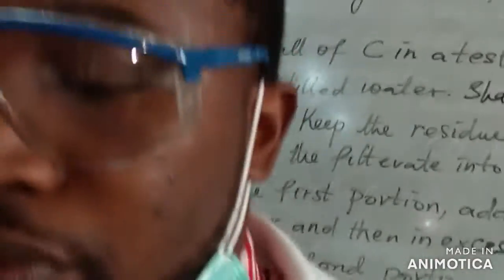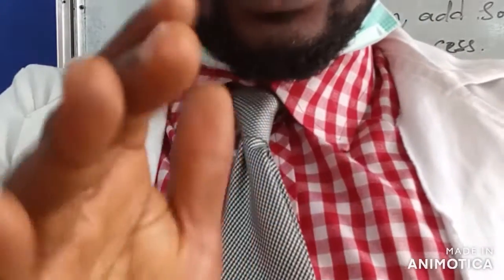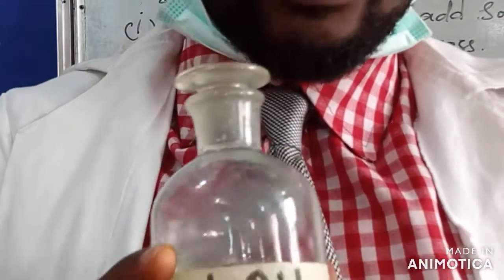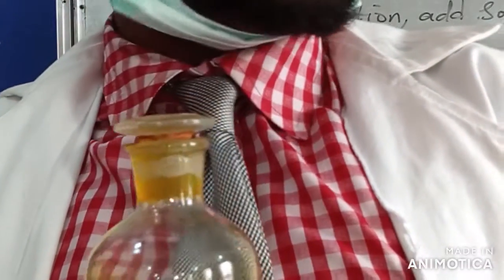Before I start, I would like to show us the reagents for today's salt test. The first one is our sodium hydroxide solution, which is very necessary for tests of cations. We also have our aqueous ammonia, which is our ammonium hydroxide. We have the barium chloride solution, and we also have our hydrochloric acid and potassium dichromate acidified.